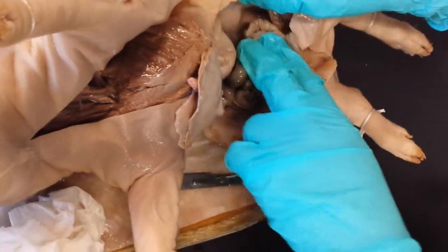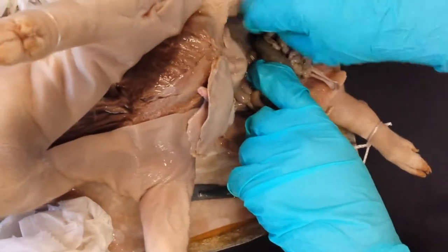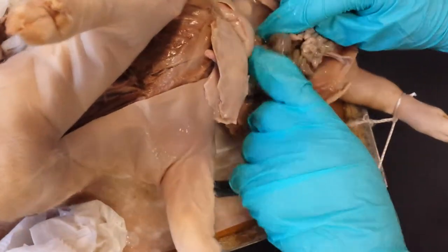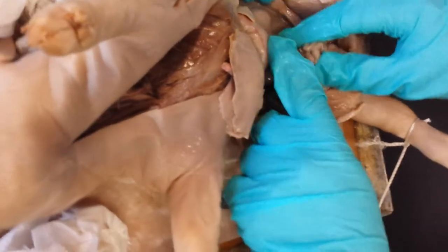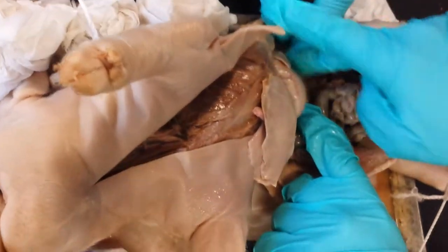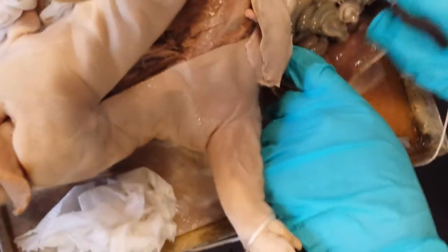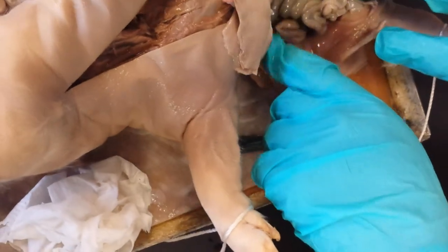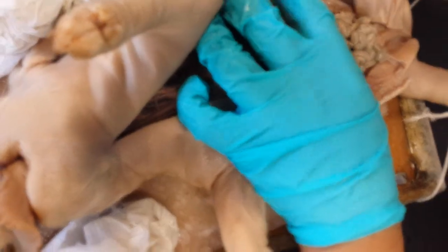Oh no, it's spilling. Oh, I'm making a mess. What's that, Ricky? Is it hard? No, it's not. Oh, yes, it is, kind of. Must be a bone. Yeah, probably. It's not a bone, dude. Not a bone? But it's still squishy. I think that's the excretion. So, what is it, like the appendix? Let's move on to number 9. Using scissors, remove the liver. Remove the liver? The liver.